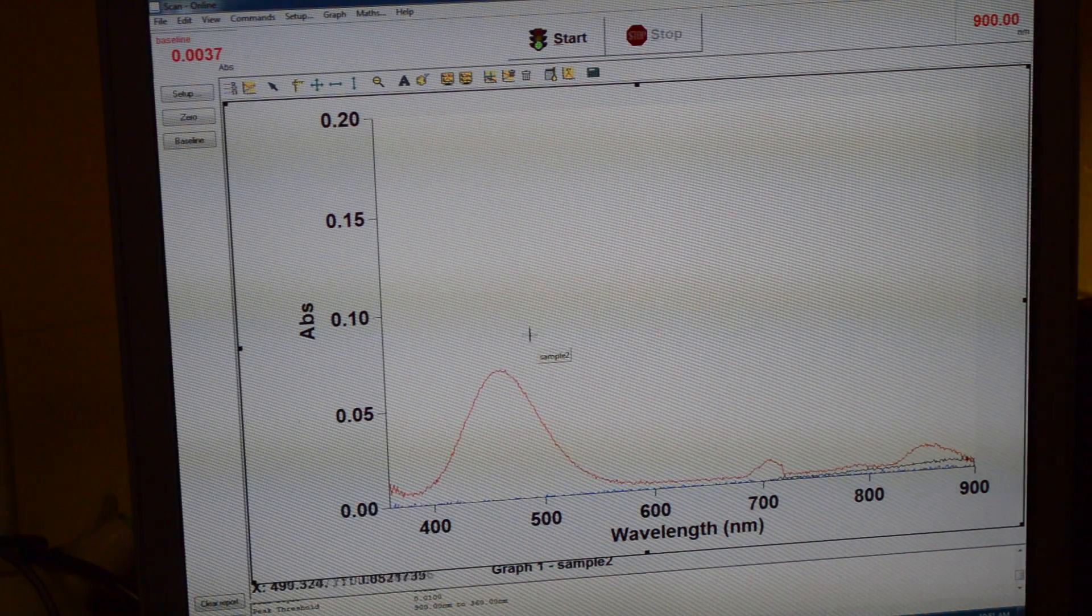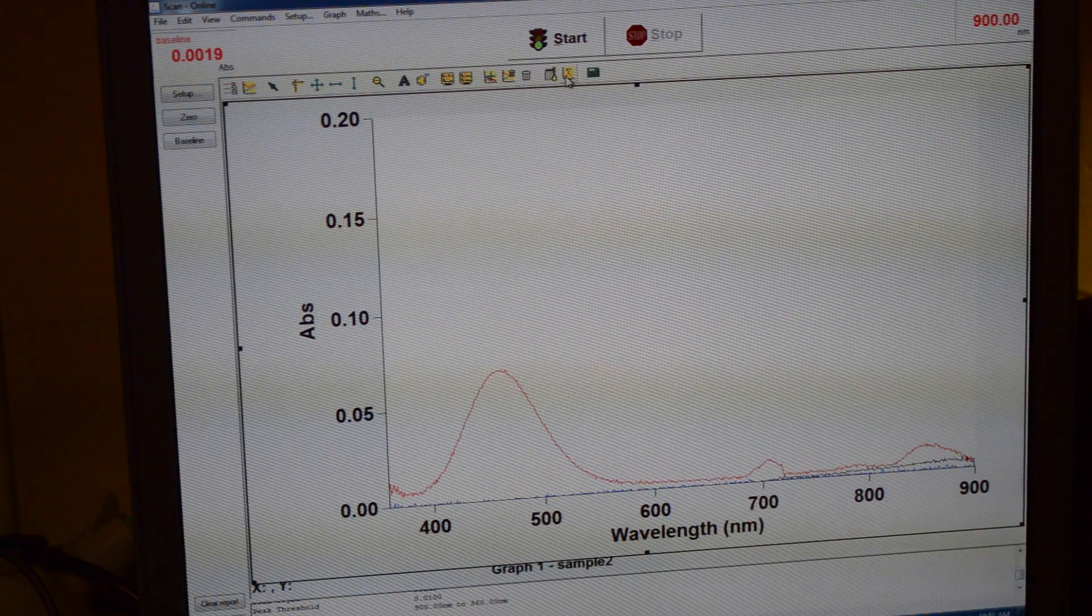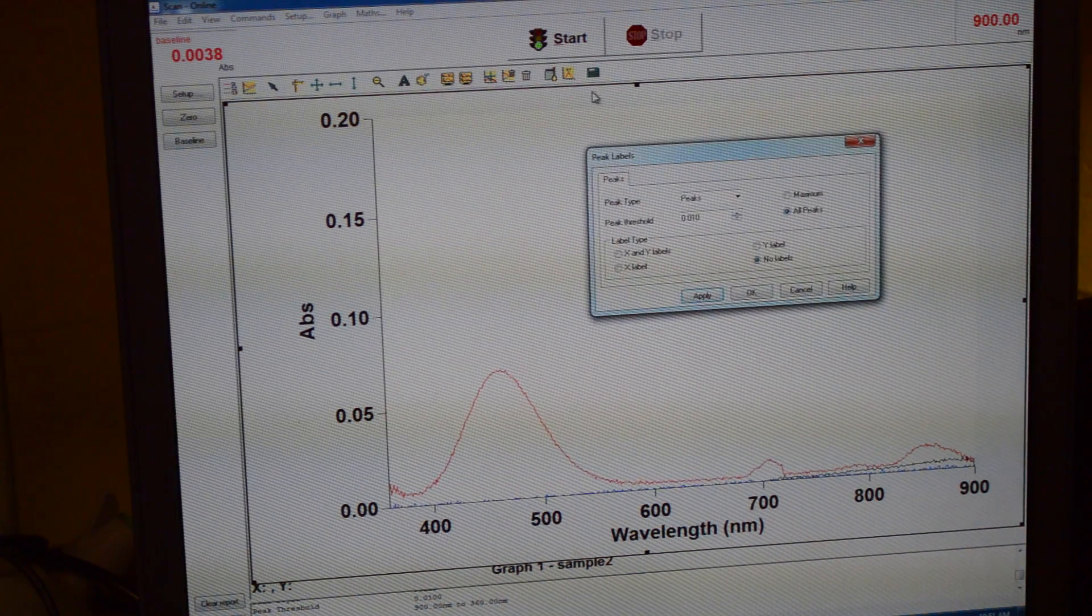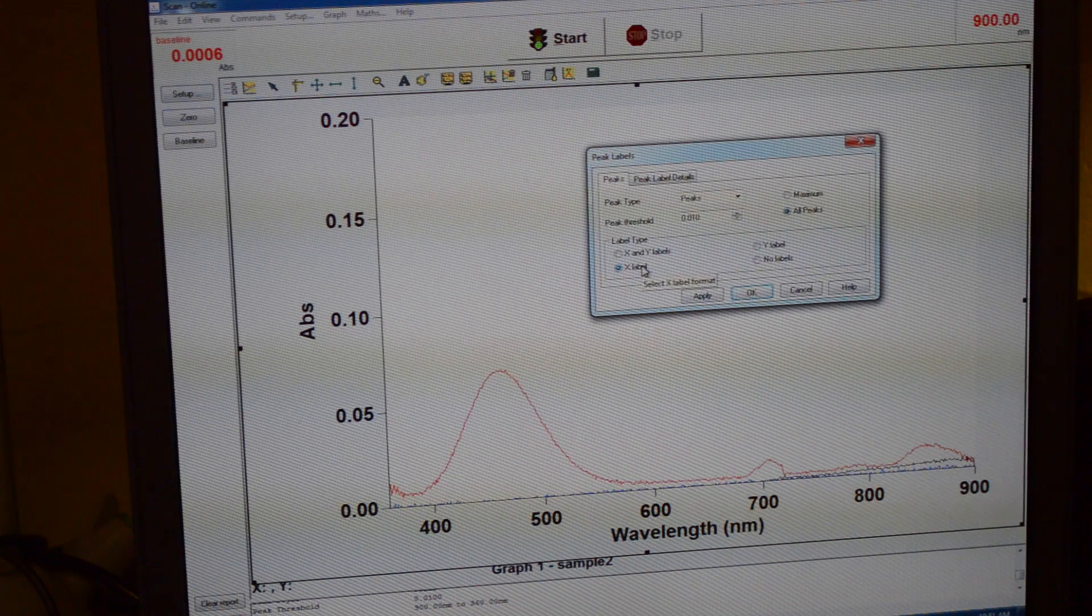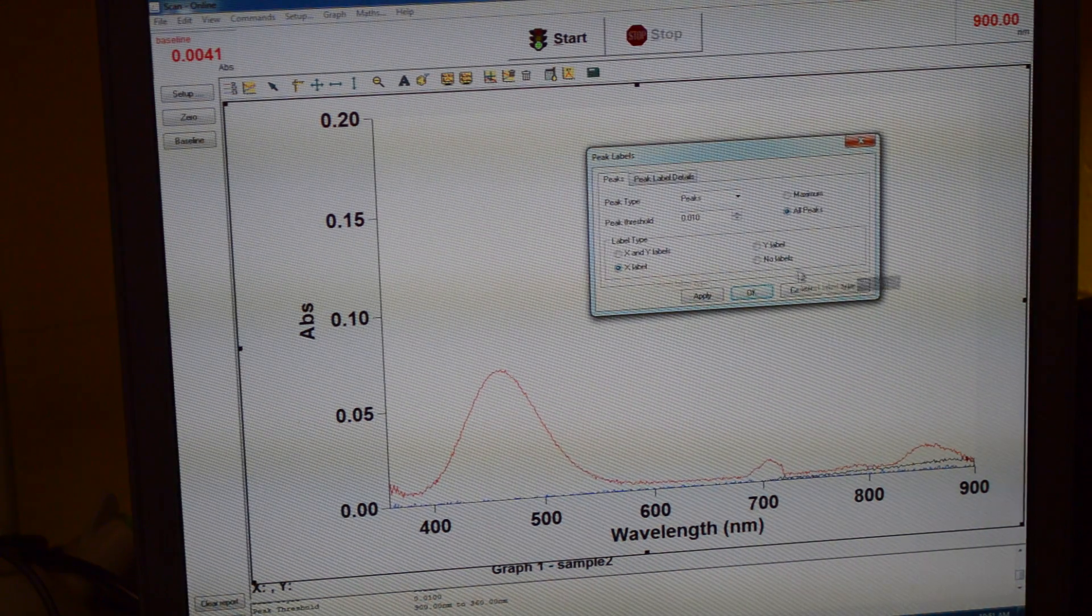Next, we want to find the xy coordinates of this peak here. To do that, you're just pressing xy and this icon is called peak labels. We just want x labels here, so we're going to click the x label and OK.